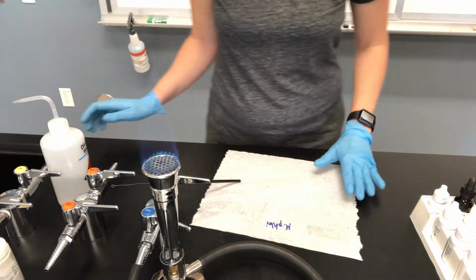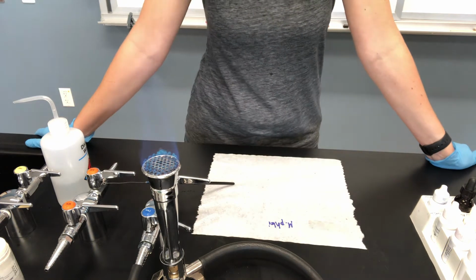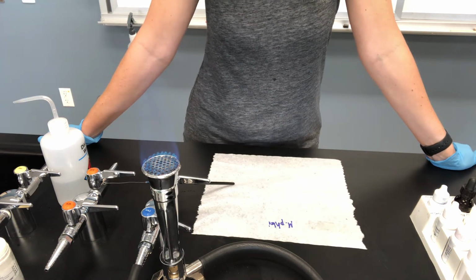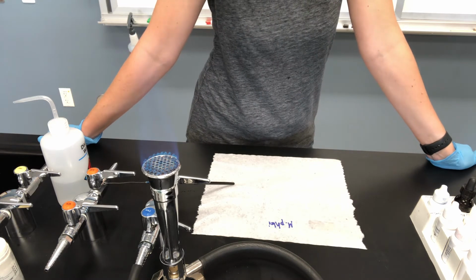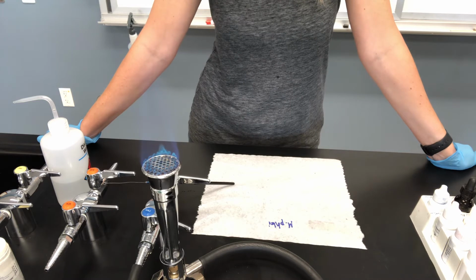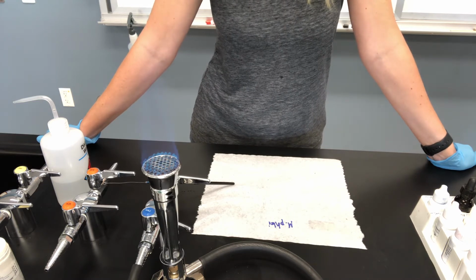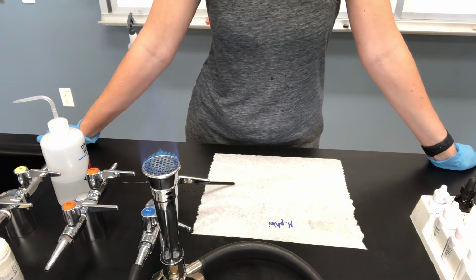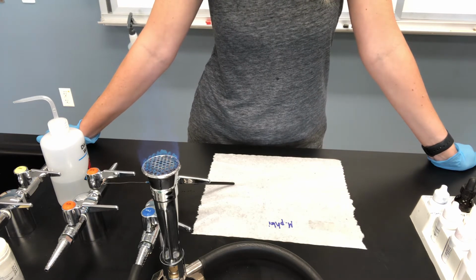You're going to get to do gram stain quite a bit in this class. You're going to do it here on the first day you're learning, and then we do gram stain again on the unknown project, and you're expected to be able to do gram stain on the lab practicum. So you'll have lots of opportunities to practice your gram stain throughout the term. But even though you'll have more opportunities to practice, it's still good to make sure you're following the instructions step by step when you're doing it the first time.